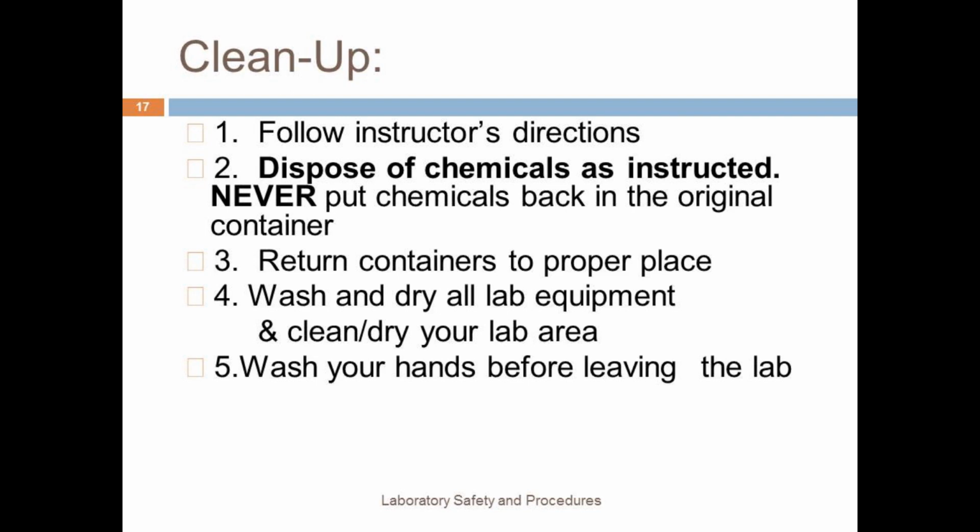Wash and dry all of the lab area. Also make sure that you wash your hands before leaving so that you do not get any chemicals in your mouth, on your face, or anywhere else.